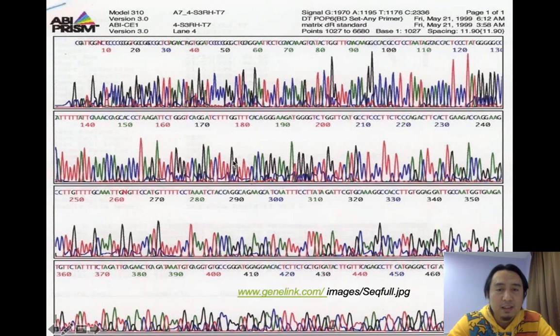Spiking means that if the graph spike is higher, for example, this example here, right? So tall, and sharp, right? It has to be sharp. Sharp means that in this location it is confirmed to be T.